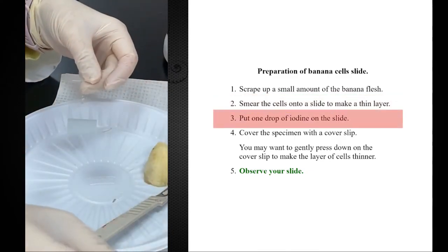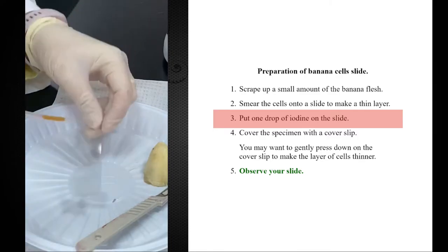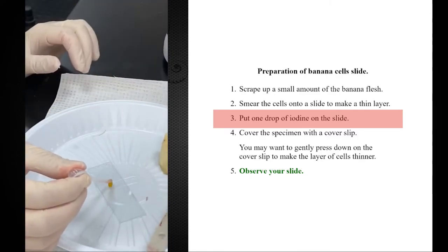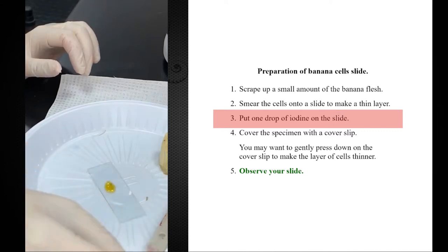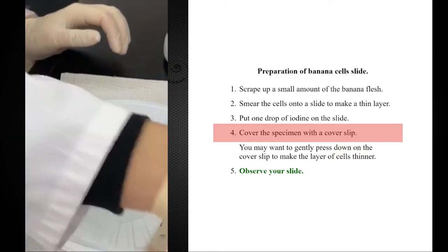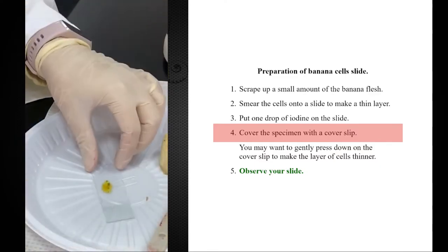Then I am going to use iodine because I want to show you the starch bundles inside the banana cells. So I will add a drop or two of iodine. I will get a cover slip and I will touch the liquid.